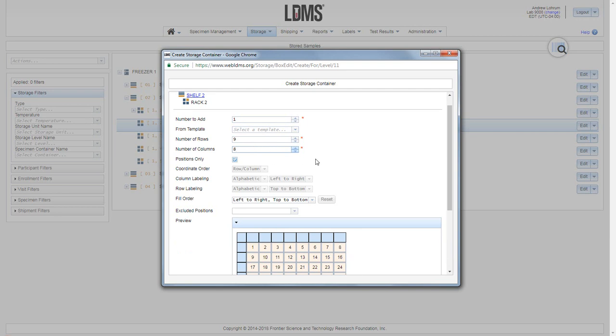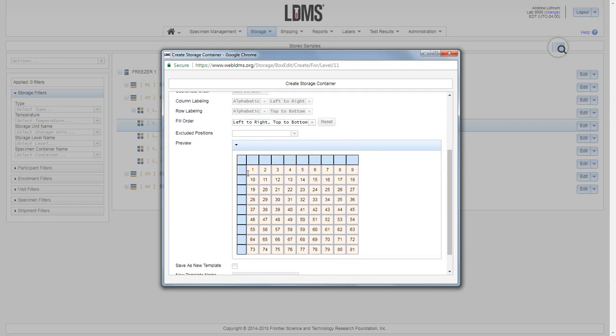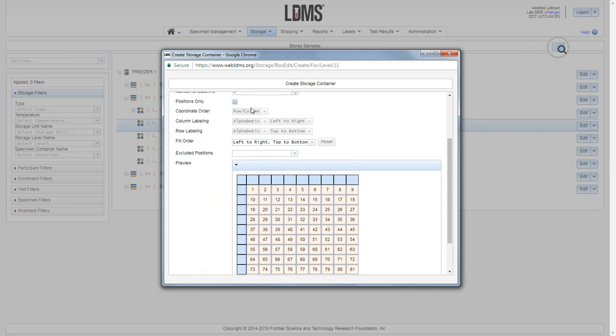Next, how is the box labeled? Once I have set my dimensions, I have a 2D representation of that box. The box is labeled as positions only, meaning that position 1 is here in the top left hand corner followed by position 81 all the way at the bottom.